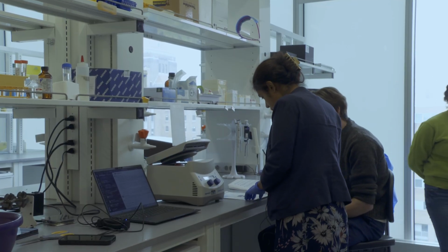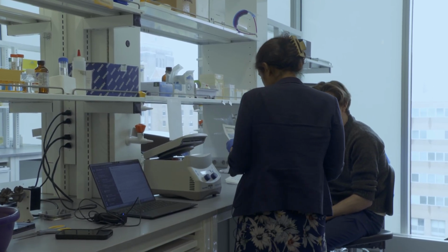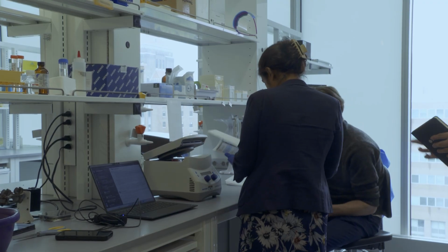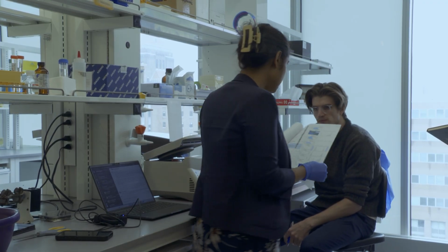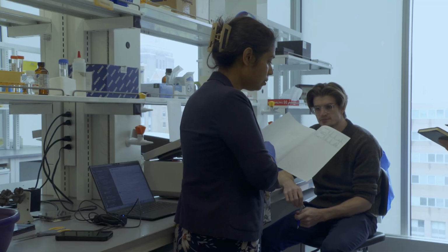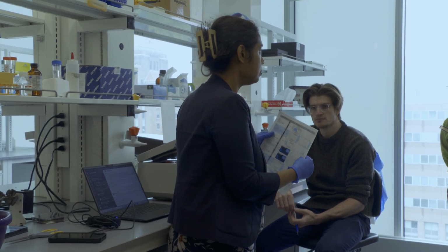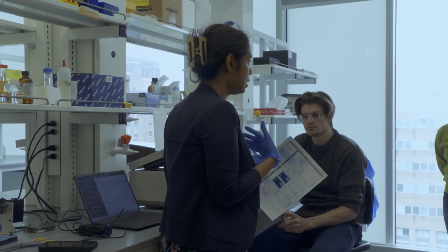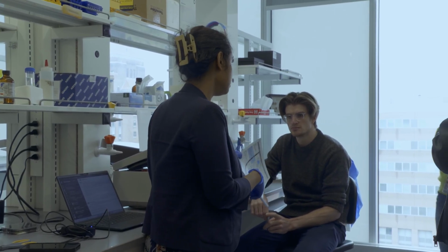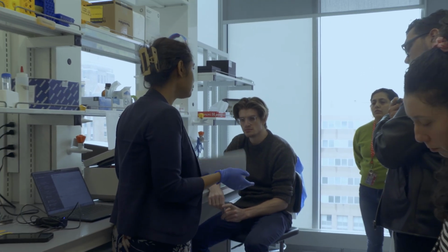So let's see. And I think this is the newer one. This is all of them. So okay, and we can figure out. One thing I know, and I think you already know, it's the TapeStation. I think the most problematic feature, more than these ratios, is the accumulation of high molecular weight fragments.